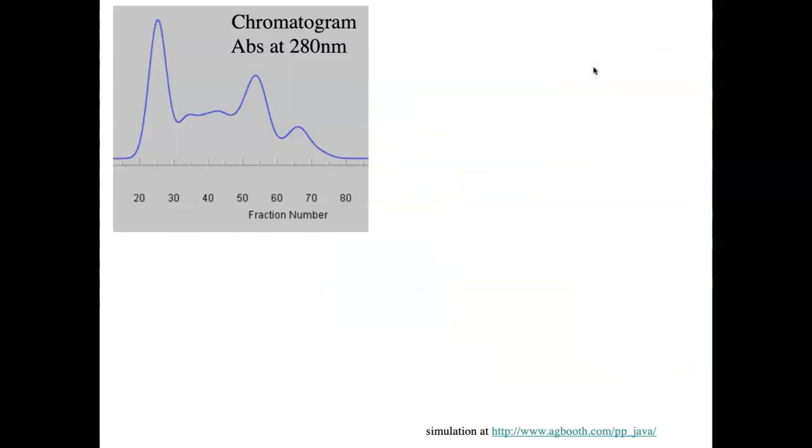All right, so when we do this kind of experiment, we collect fractions, and guess what? We can monitor the presence of proteins by measuring absorbance at 280, right? It's very non-invasive. Many chromatography machines are equipped with UV detectors, so you're reading absorbance as stuff comes through. If you don't have that, you may have to measure by hand, just take samples.